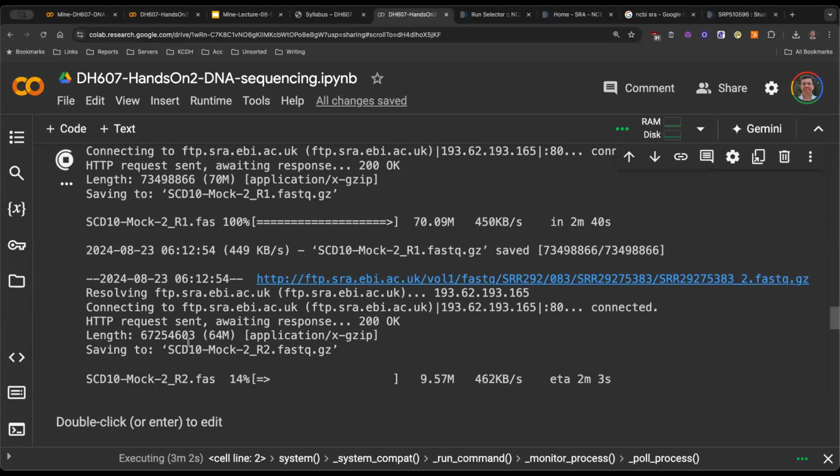Which means that this is the general distribution around which all your fragments vary. And this depends on what kind of shearing technology you're using. It can vary from 400, it can go very small also, it can go all the way to 200. But think about it, if you have a technology that is able to sequence 150 nucleotides, or even more, you want to keep the fragment length larger than that. Okay, does that make sense?